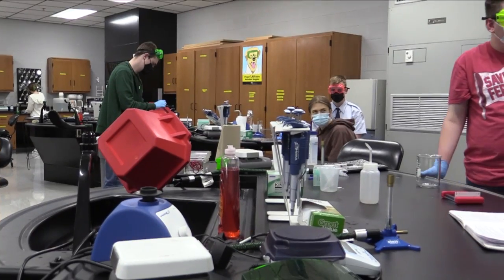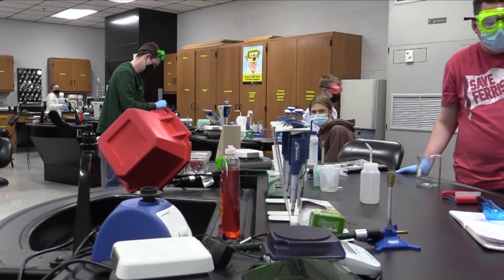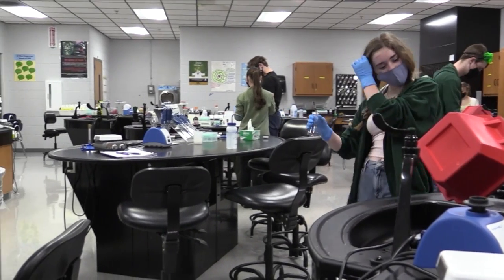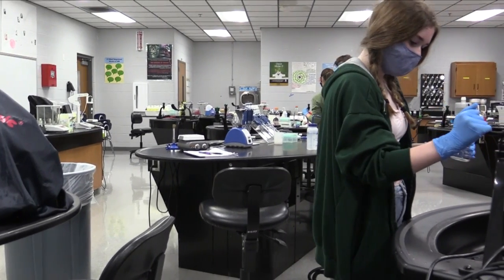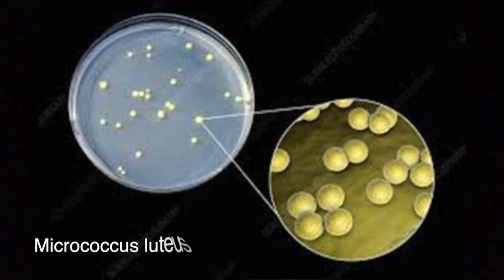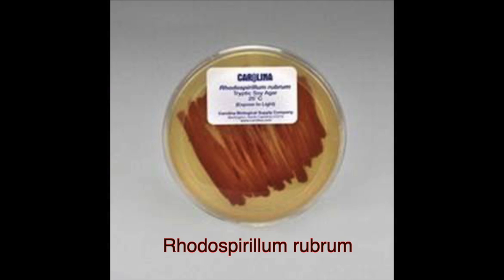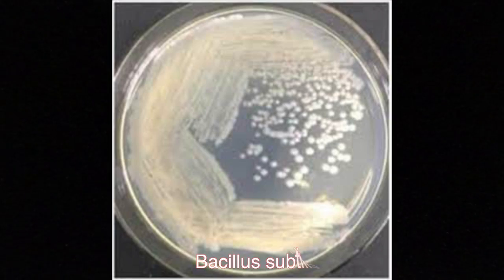In this microbiology lab, students melted nutrient agar and poured it into petri dishes to provide food for the bacteria. Students chose a strain of bacteria that they wanted to grow. They chose from Micrococcus luteus, Rhodospirillum rubrum, or Bacillus subtilis.